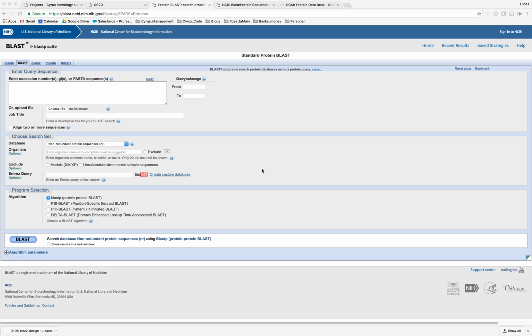This is a tutorial video for Cyrus Bench Homology, hm.cyrusbio.com, for how to use that tool to generate a model of a symmetric homodimer protein with a C2 symmetry. This is a really common type of symmetry in the world of protein structure.